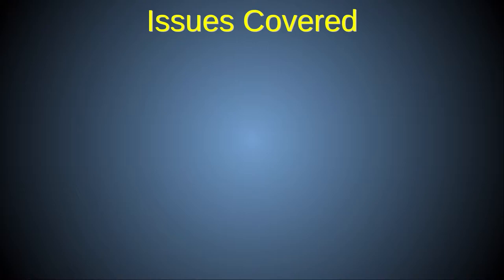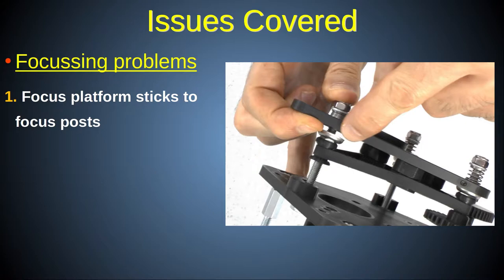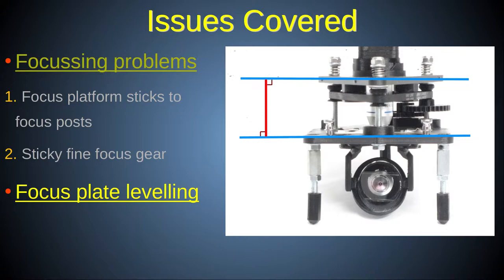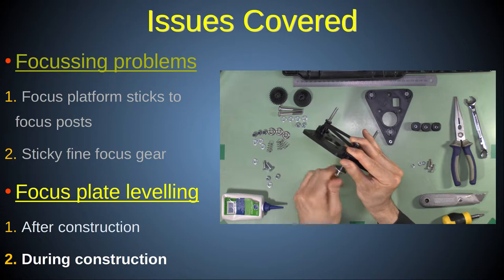The issues addressed in this video fall into two main categories. First are issues relating to sticky focus motion, where turning the focus gear results in unexpected or difficult movement. This can be due to the focus platform sticking on the focus post threads, or a sticky focus gear, although that can sometimes be useful. The second main category is focus platform leveling, with two main subcategories: leveling issues that occur after construction, and a technique for getting the focus platform accurately level during construction.